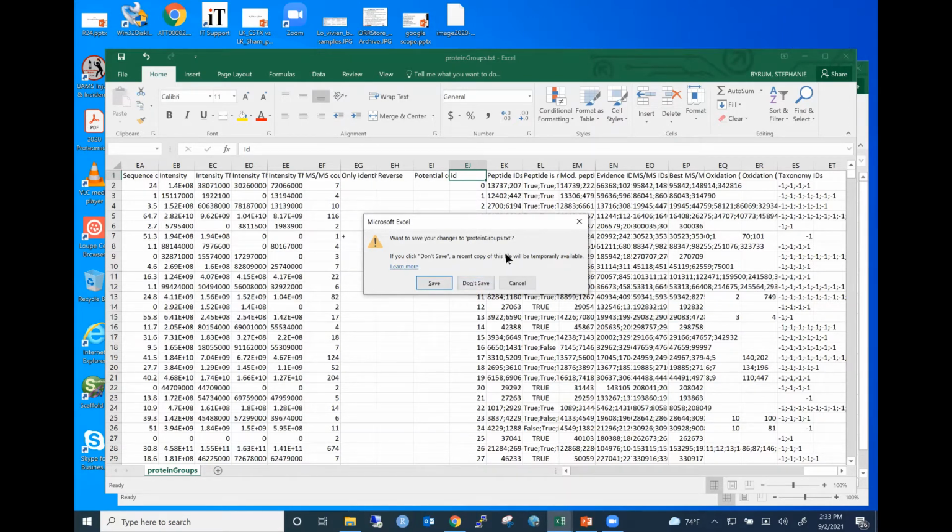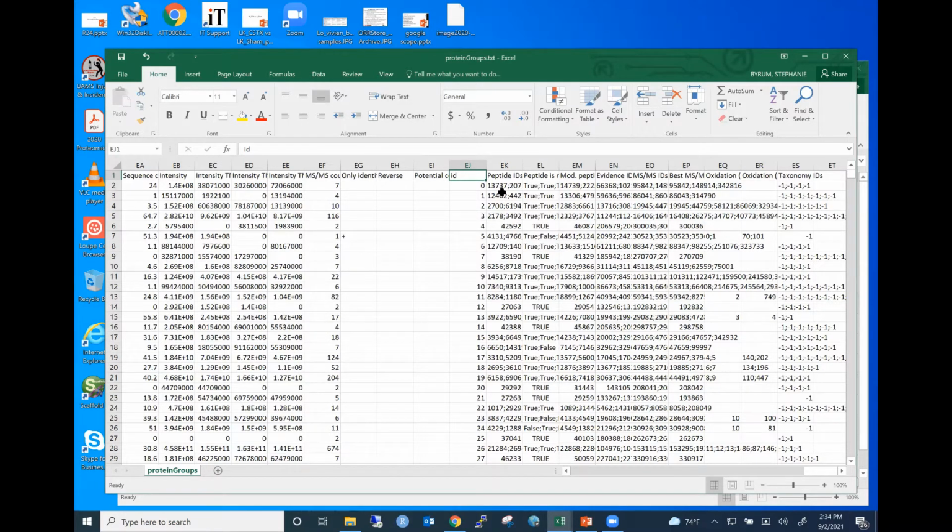I have another question. When we talk about RNA-seq data and we're looking at counts, anything under 10, in the core we think of as noise and don't really trust. If we see 2, 2, 2, 2, 2, we'll get rid of that gene. In terms of reporter ions, is there a level that you consider semi-noise if you see it all the way across? Let's say it's 1,000 across all of them. It's like, well, this is probably not a true abundance measure. Do you have a level that you look at or not really?